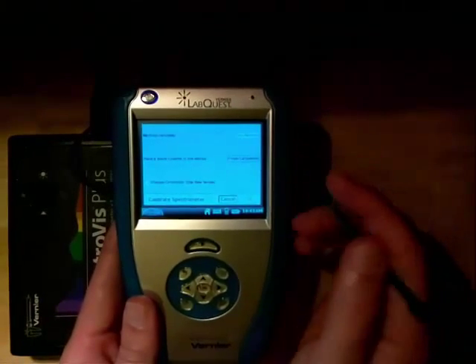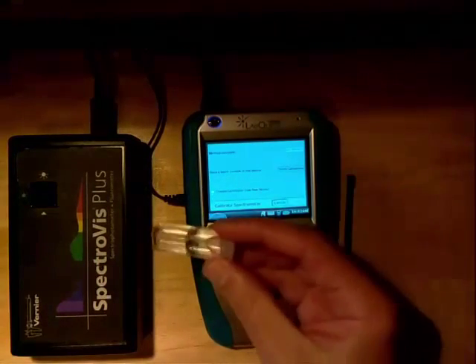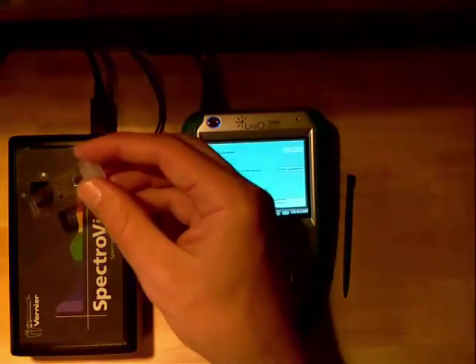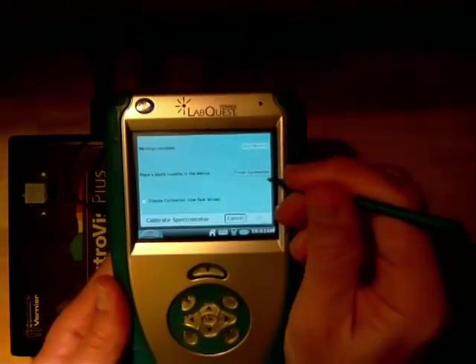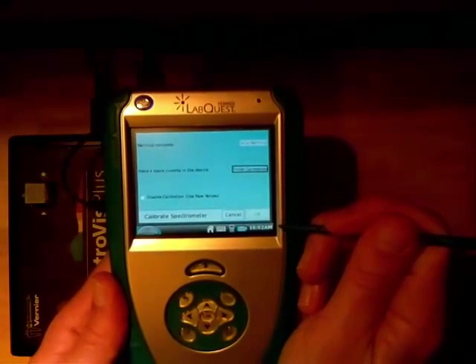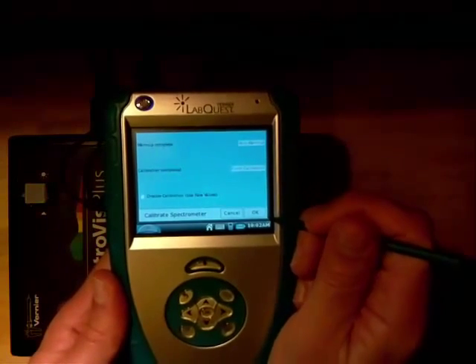Notice how it says 'place a cuvette in the device to finish calibration.' I'm going to use the water as the blank and put it in like so — and then finish calibration. Wait until the OK comes up; it should take around 5 to 10 seconds. If it takes much longer than that, there may be a problem, so check with your professor.